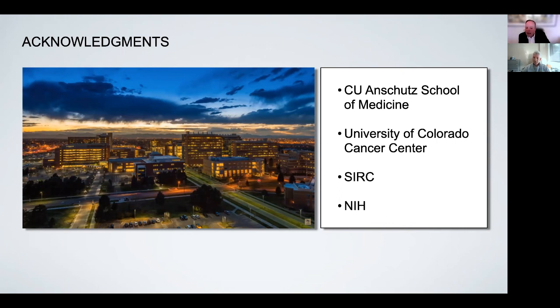The reason is that the facility doesn't have the human resources to do that. We have computational resources, but doing data analysis for a cryo project can be very time consuming, and it would require a heavy investment from somebody. So typically the way we do that is either through a collaboration or by providing training and advice and helping somebody do the processing themselves.